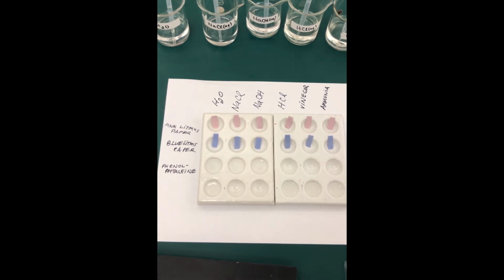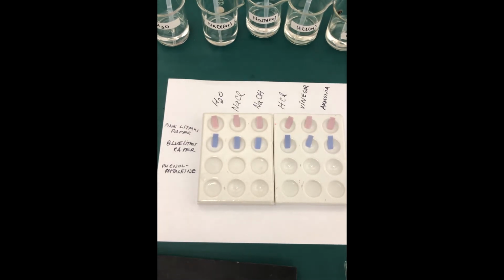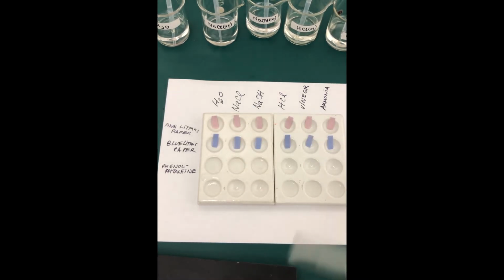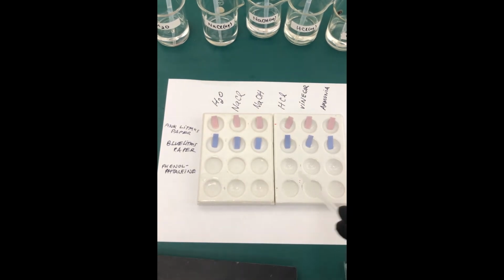The first one we're going to do is called the litmus paper test. Litmus paper is a paper that has been coated with a special chemical that changes color in the presence of a solution that has acid or base in it. We're going to test it out. So we have pink litmus, blue litmus paper. And I have put samples of each one of our items in these wells.